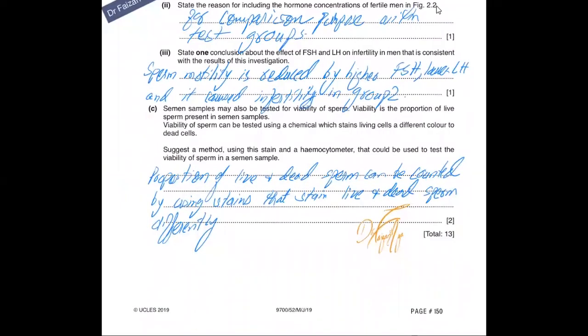Part C: Semen samples may also be tested for viability of sperm. Viability means how many are living - the proportion of live sperm present in semen samples. Viability can be tested using chemicals which stain living cells a different color than dead cells. Living sperm and dead sperm can be differentiated. Suggest a method using this stain and a hemocytometer to test viability of sperm. You can count the proportion of live and dead sperm using the microscope and hemocytometer with these stains because they stain live and dead sperm differently.